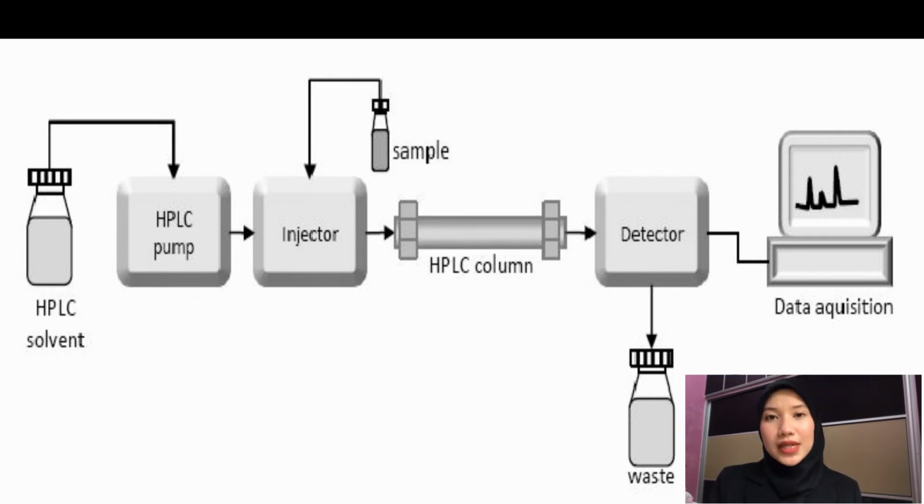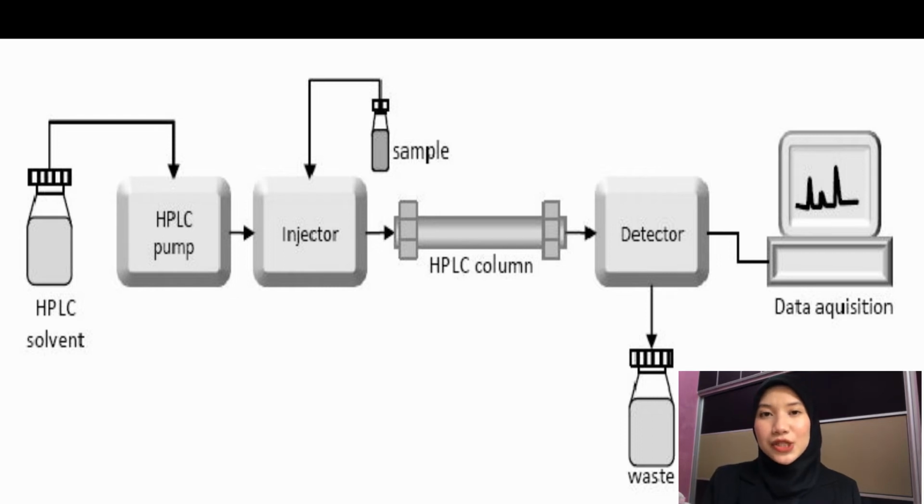The pressurized liquid is typically a mixture of water, acetonitrile, and methanol, and is referred to as the mobile phase. The components in the mixture are separated due to their different degrees of interaction with the absorbent particles. This causes different elution rates for the different components and leads to the separation of the components as they flow out of the column. Compared to column chromatography, HPLC is highly automated and extremely sensitive.